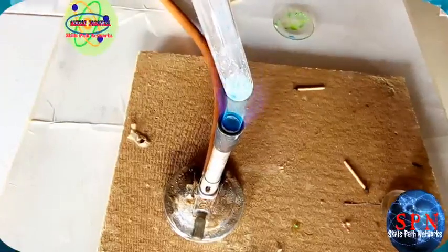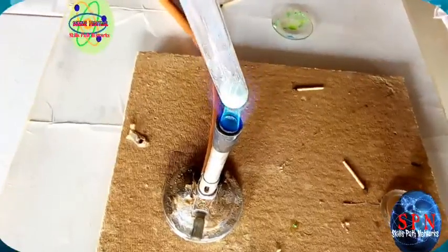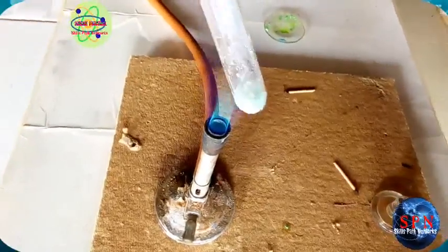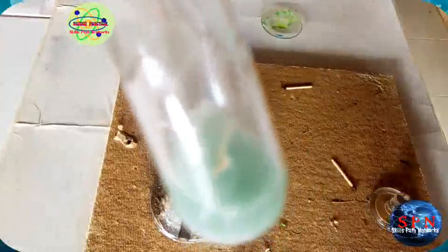I think you see the change from blue to white observed. This is white.